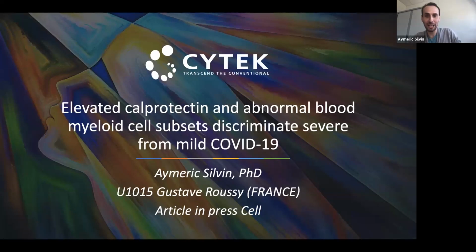Thanks, Maria. I would like to thank Cytek and CYTO 2020 for giving me the opportunity to present the work that we did in Gustave Roussy during the COVID-19 period, which happened between March and May in France. During this period, we used our Aurora machine a lot in order to build up the paper entitled Elevated Calprotectin and Abnormal Blood Myeloid Cell Subset Discriminate Severe from Mild COVID-19 patient.